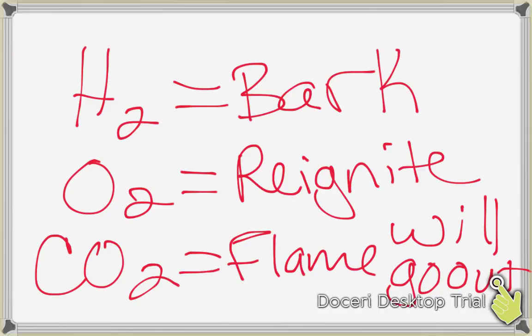Okay, now I need to make sure that you guys are following all lab procedures. You need to have your goggles on the entire time, regardless of if you are dealing with it or not, because we have hydrochloric acid out there, which even if you get it on your hands, you'll feel a little bit of irritation, so you definitely don't want that in your eyes. So make sure that you have your goggles on the whole time, no matter if you're doing that part of the experiment or not, because people around you are also using it. So make sure you have your goggles on the whole time.